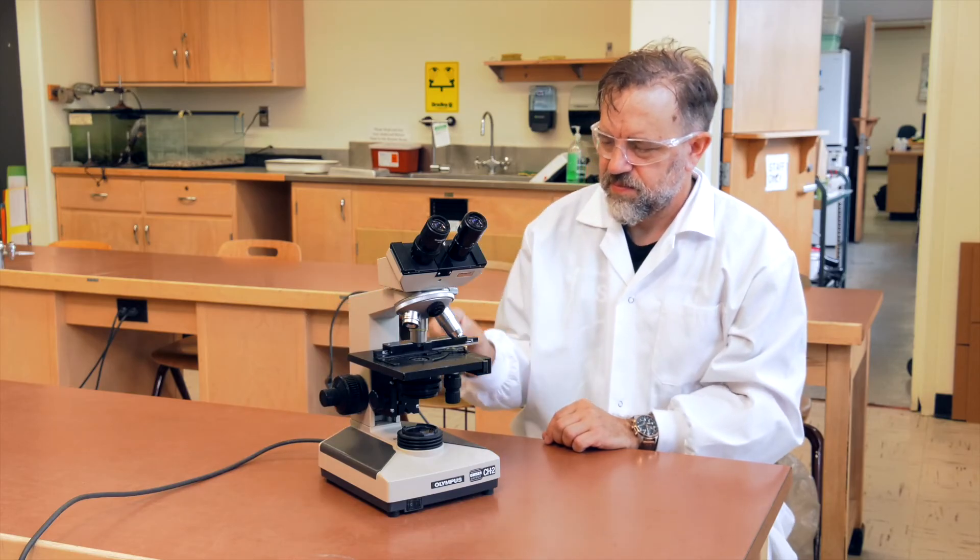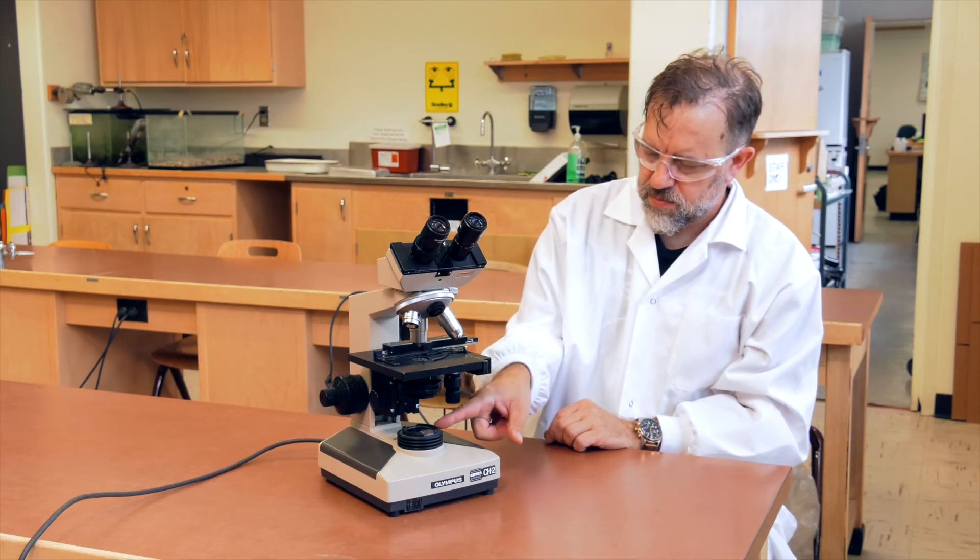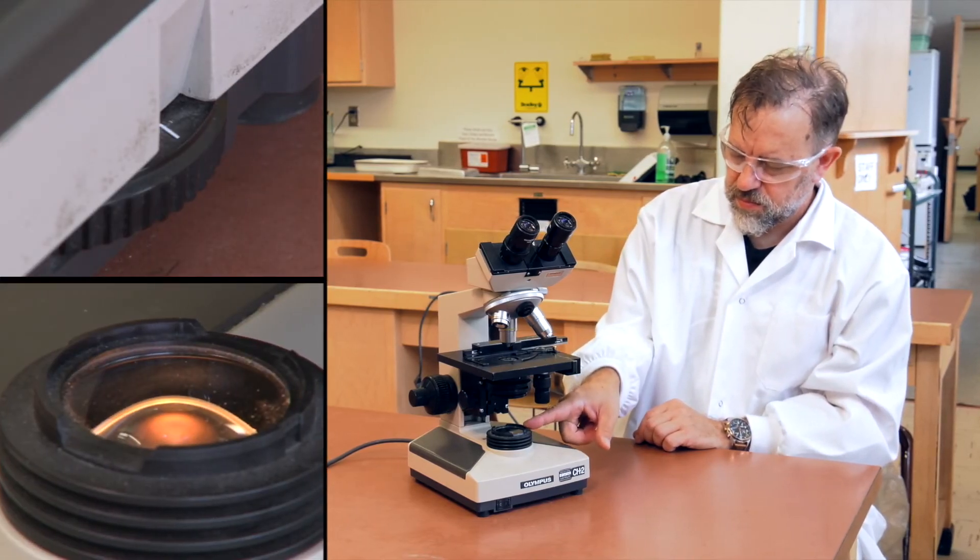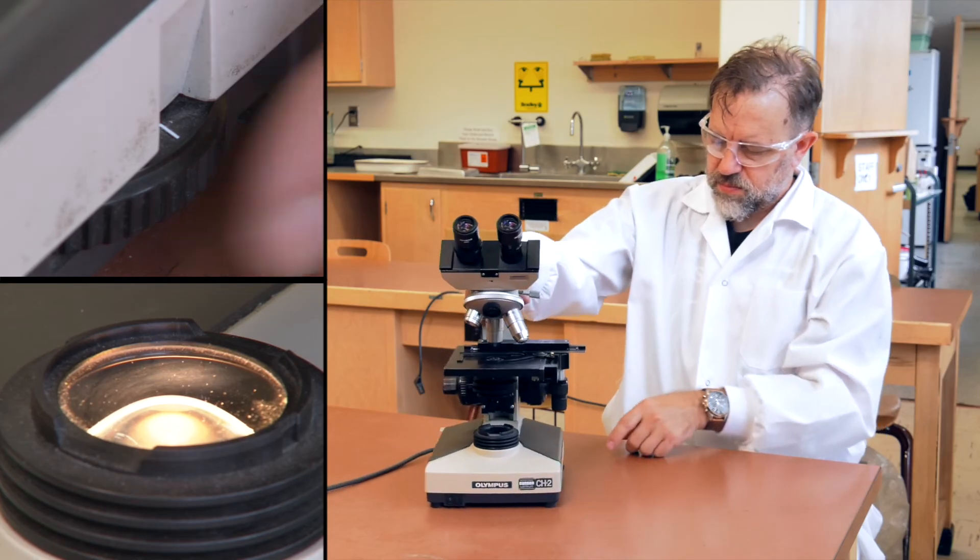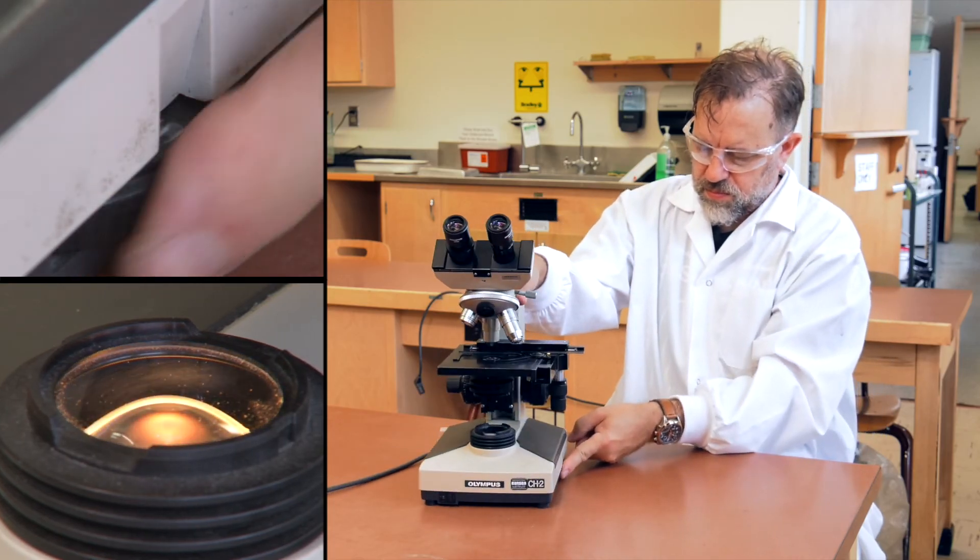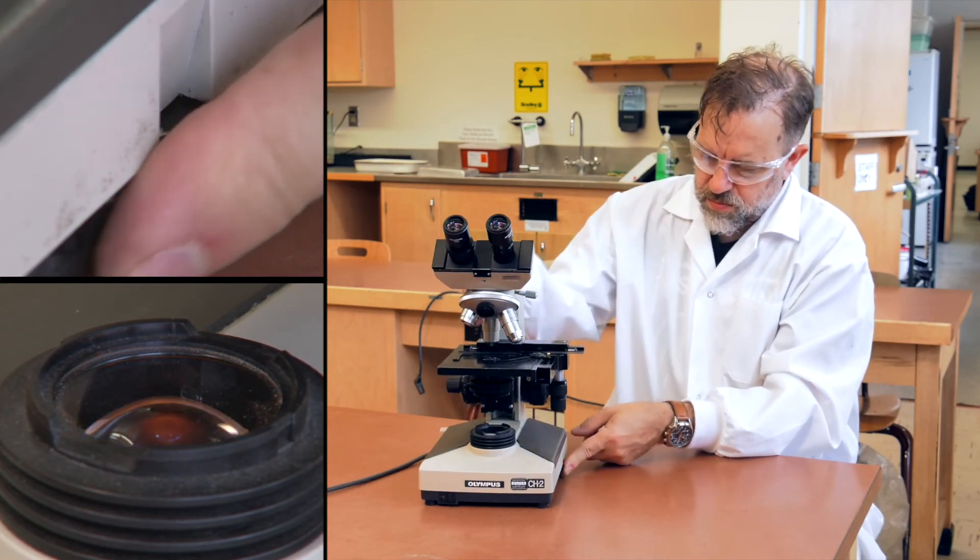In the base of the microscope are the light source and the light intensity control. The control directly adjusts the brightness of your light source. Your head TA will tell you the appropriate level for your model of microscope.